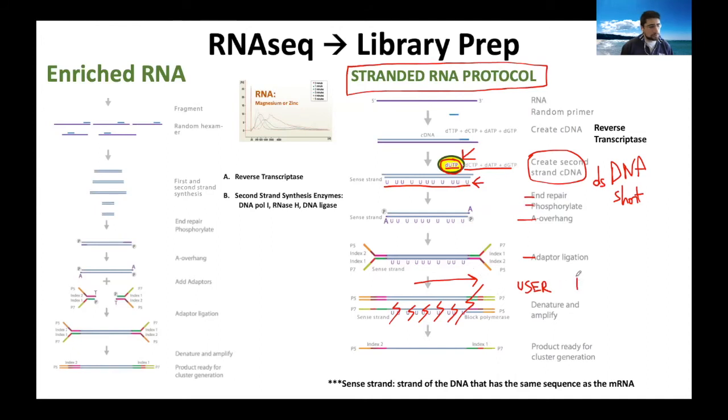So this is one approach, okay? And the second approach, an alternative, is using a DNA polymerase that is not able to read the filament with the uracil, okay? So if you remember from the previous slide, when we were talking about DNA methylation, after you treat the DNA with bisulfite, you have your fragments that contain uracil, and then you need a polymerase that is able to read uracil in order to amplify it. In this case, we're actually doing the opposite. We're using a polymerase that is not able to recognize uracil in the template, and so we're not able to amplify this filament.